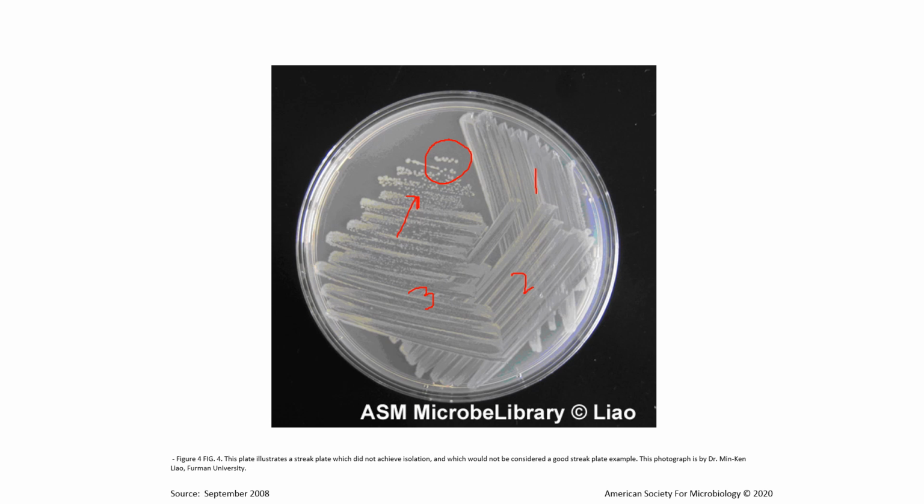So what I would do personally is I wouldn't go back and forth into the previous quadrants quite as many times as this experimenter did. I might go back 3 times, but certainly no more than 3 times. You can see they went back 1, 2, 3, 4, 5, 6, 7, at least 7 times.